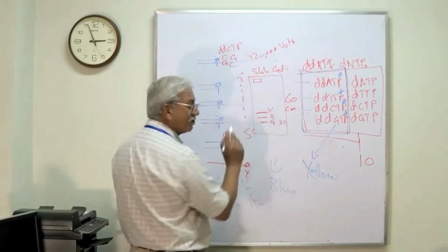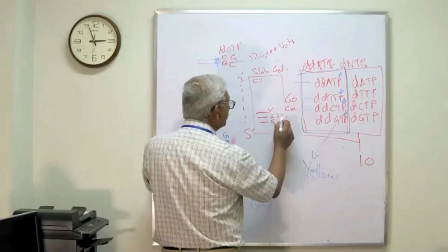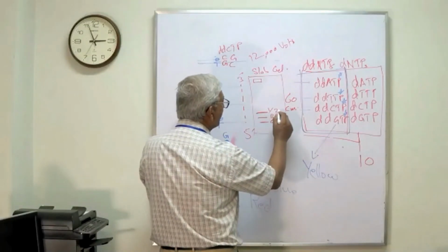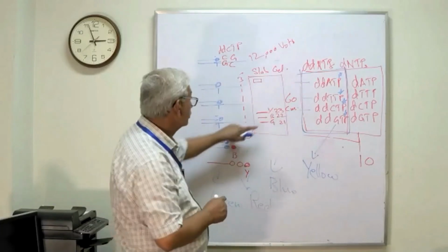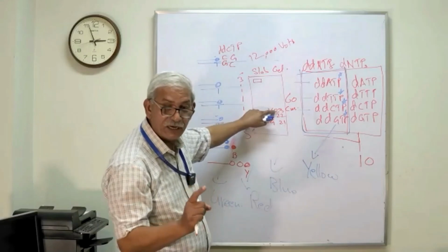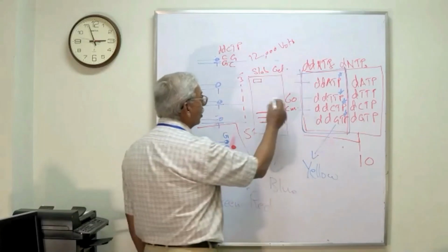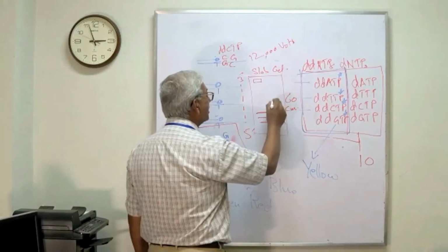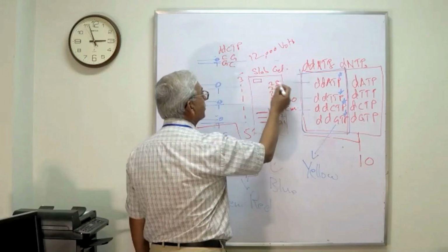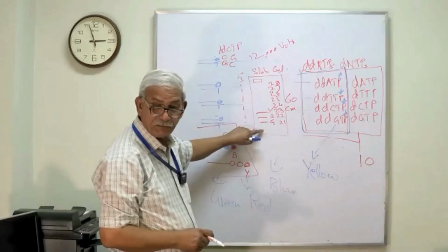This fragment, which has gone to 2 additions, is having 22 nucleotides. The fragment behind that is having 23 nucleotides. So every fragment is different by 1 nucleotide. These are the nested sets, and so on. It will go like this: 24, 25, 26, 27, 28 nucleotide long. Longer DNA fragment, shortest DNA fragment.